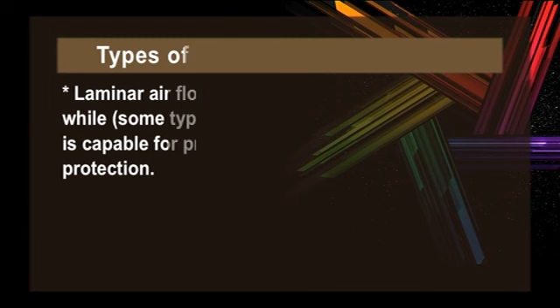The laminar airflow, unlike a laboratory chemical fume hood, is not designed to contain aerosols generated by the procedure. The personnel are exposed to these aerosols. Laminar airflow is not a biological safety cabinet. These two cabinets, although they do not differ in appearance, are totally different and cannot substitute for each other.